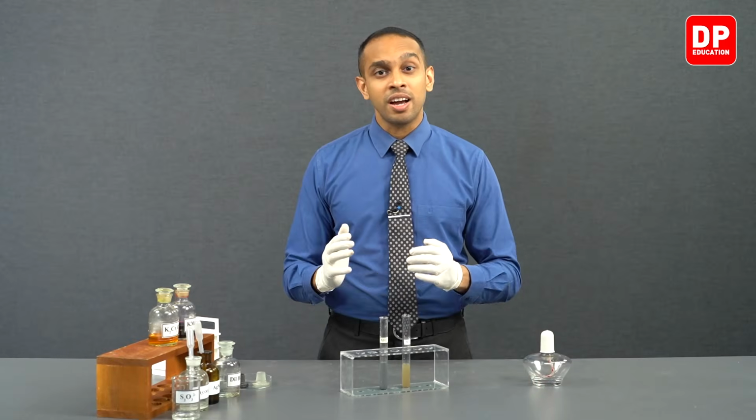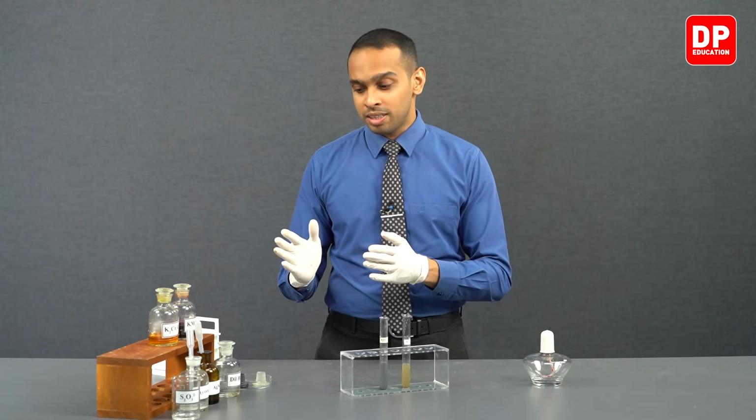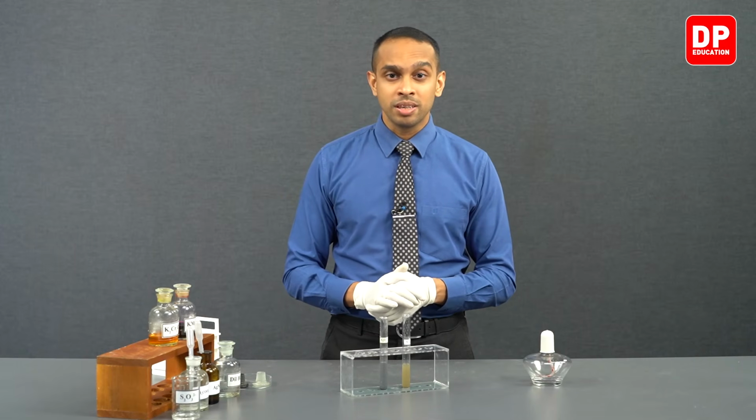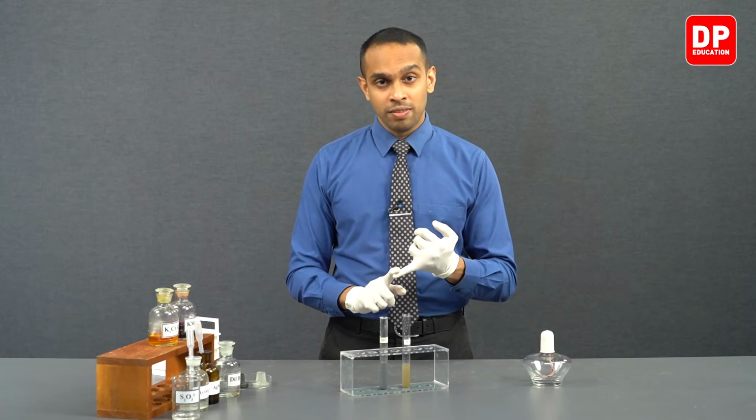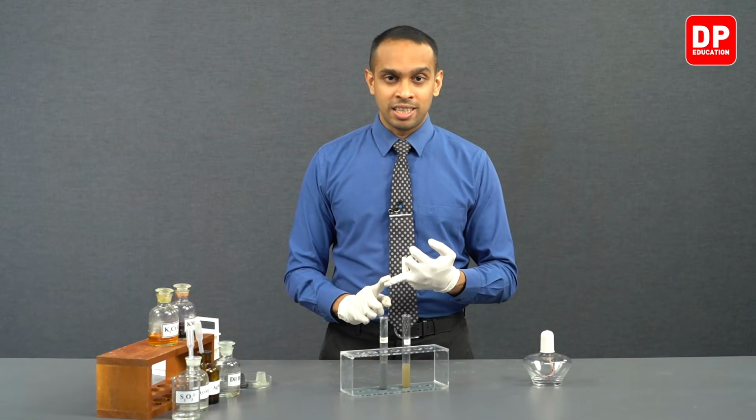ions. And then afterwards, we moved on to reacting our thiosulfate with silver nitrate and lead acetate.